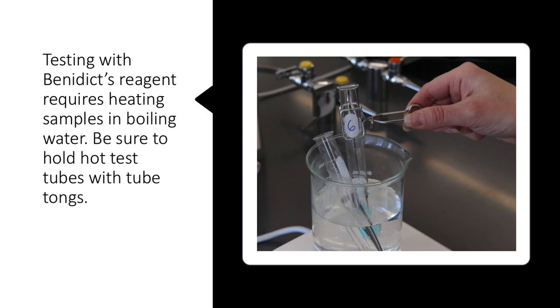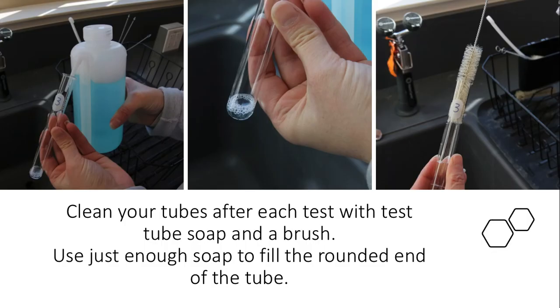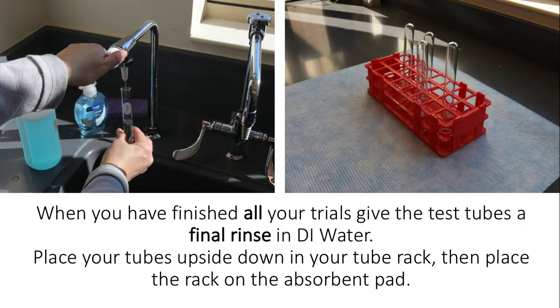So as I said, we're going to be boiling stuff. Be safe, don't burn yourself. Use test tubes whenever you're doing lab, not virtually. And make sure to clean up after you do your fake experiment online. Alright, so whenever you have finished everything in class, and this is a good reminder for anybody that does go to in-class stuff in the future, always be a good laboratory participant and clean up after yourself.